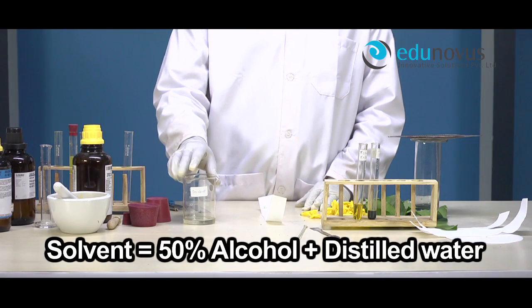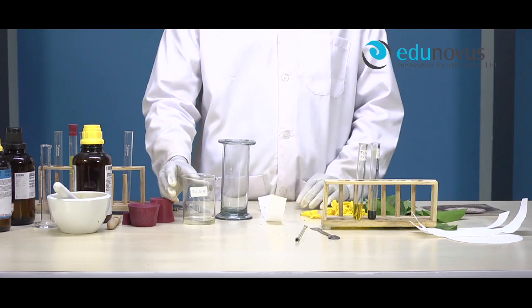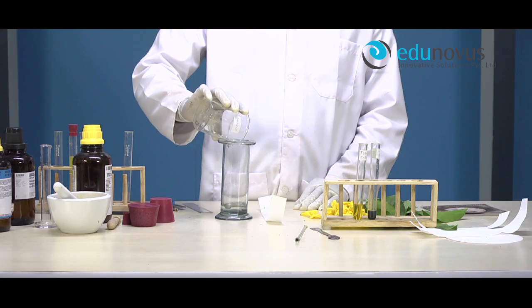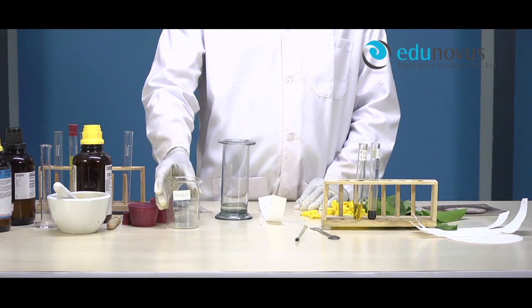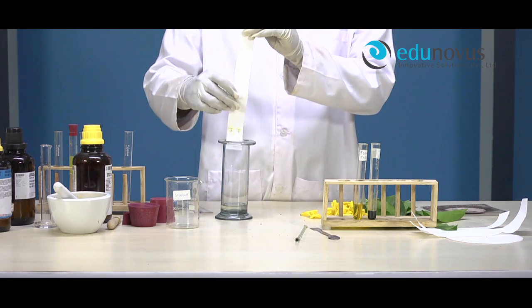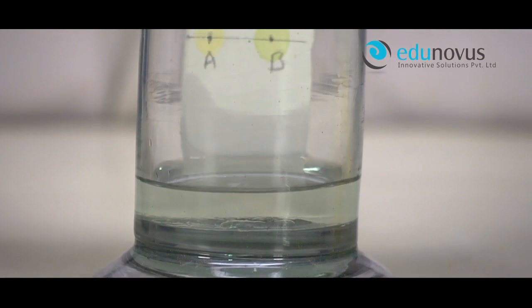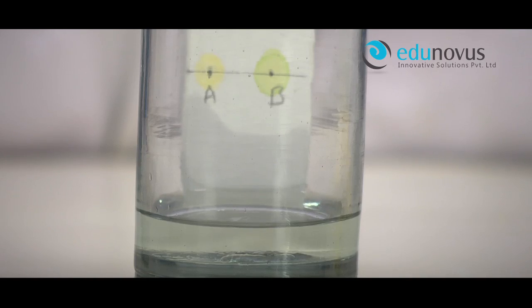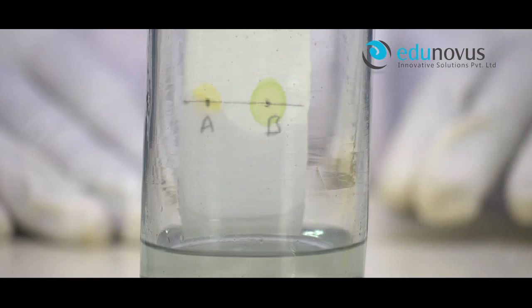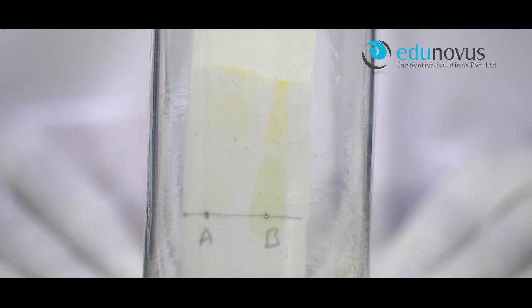The solvent used here is 50% alcohol and distilled water. Transfer the solvent into the glass jar. After that, suspend the filter paper vertically in the glass jar such that the base line remains above the solvent level. Cover the jar with a rubber cork and keep it undisturbed. Notice the rising solvent along with the flower and leaf extract.